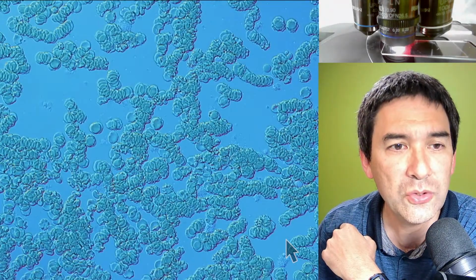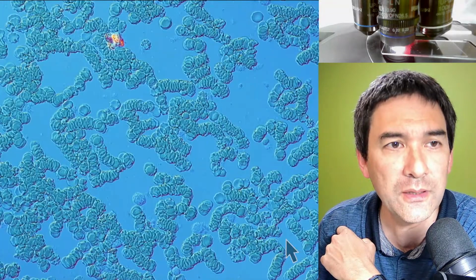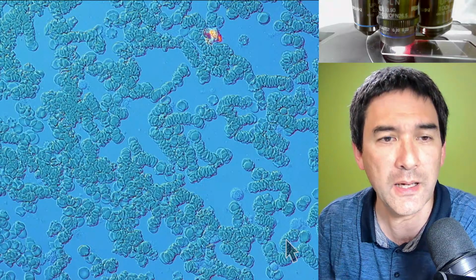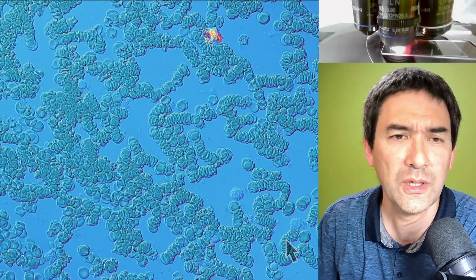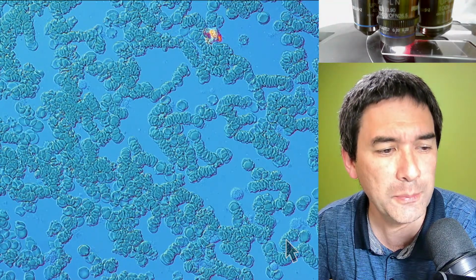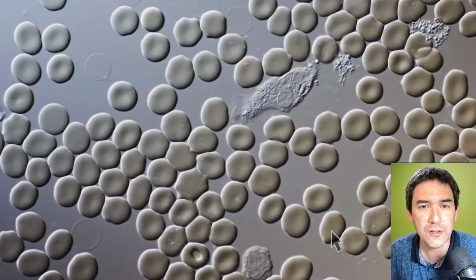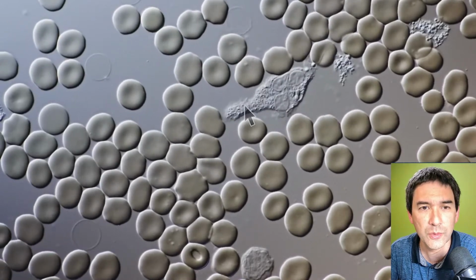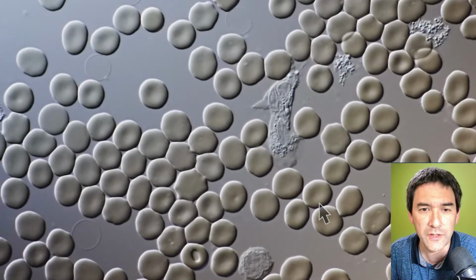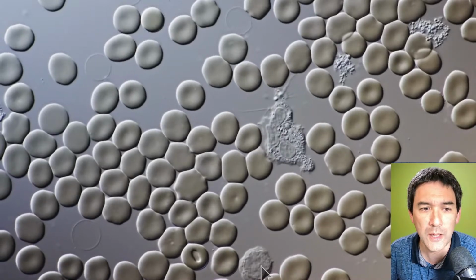So what I would like to do now is show you quickly the time-lapse video that I made of my blood using a very high magnification. I think I might have even used the oil immersion for that, and I was speeding it up 10 times. Okay, have a look at this. What we see here is one of those white blood cells, and look how it's moving around. The other red blood cells over here are simply moving around because of capillary action. There's another white blood cell down here.